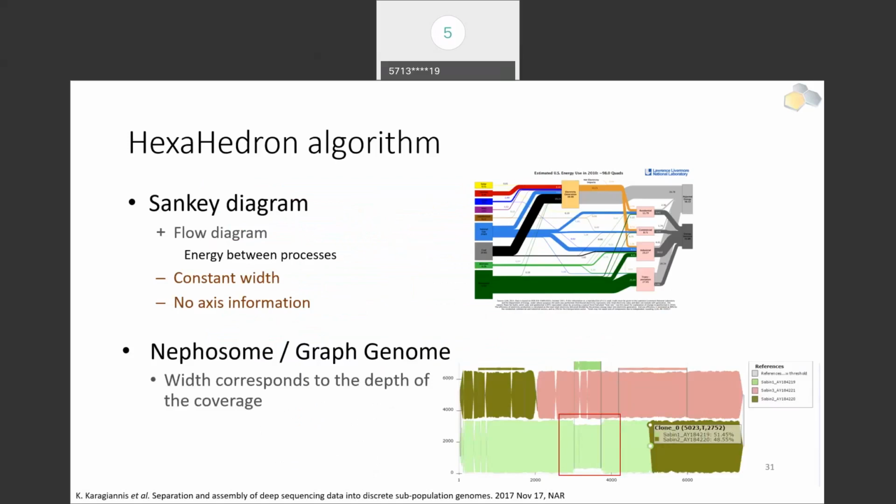So the whole point of what I wanted to show you here is that this sliding window eventually creates these graphs, which are also presented as graph genomes in the world of sequencing assembly, the human sequencing assembly. That's a relatively recent development, but they're also here in virology a way to describe quasispecies.